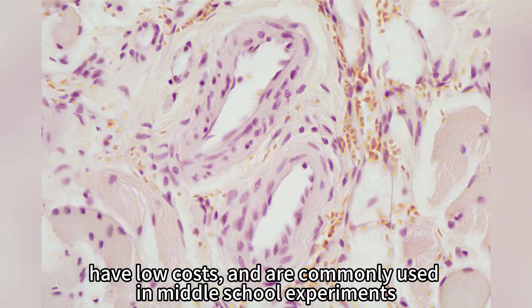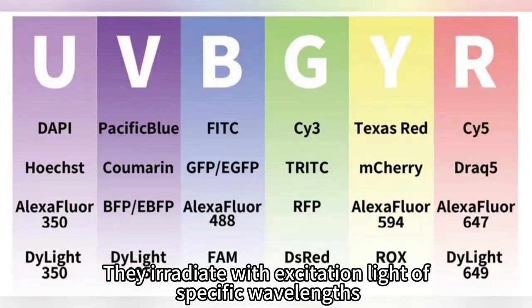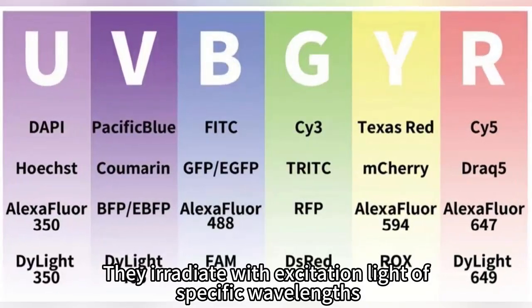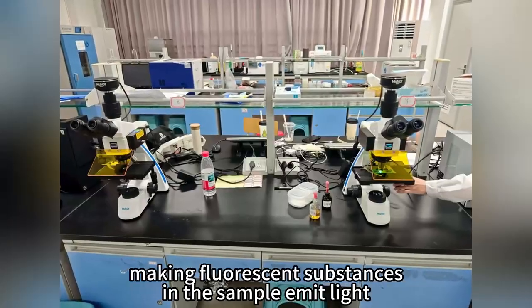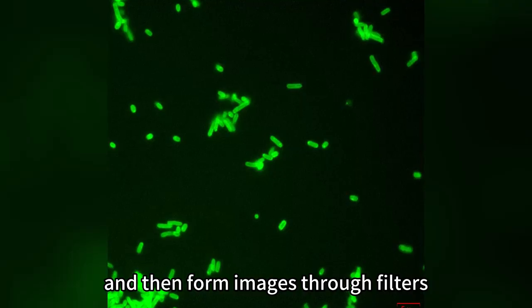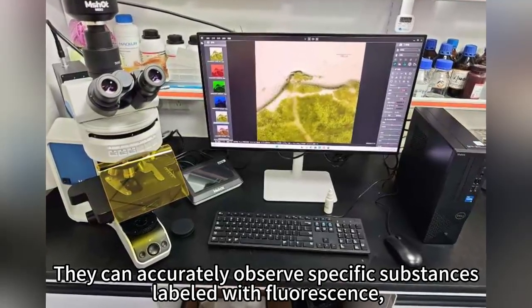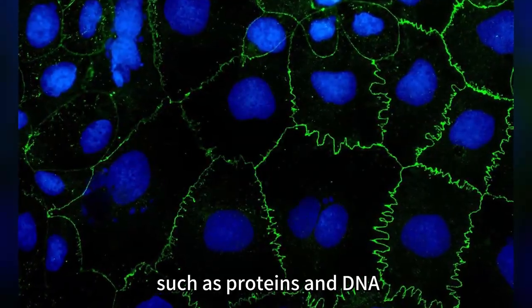They are suitable for observing colored or stained samples, are easy to operate, have low costs, and are commonly used in middle school experiments. Fluorescence microscopes are different. They irradiate with excitation light of specific wavelengths, making fluorescent substances in the sample emit light, and then form images through filters. They can accurately observe specific substances labeled with fluorescence, such as proteins and DNA.